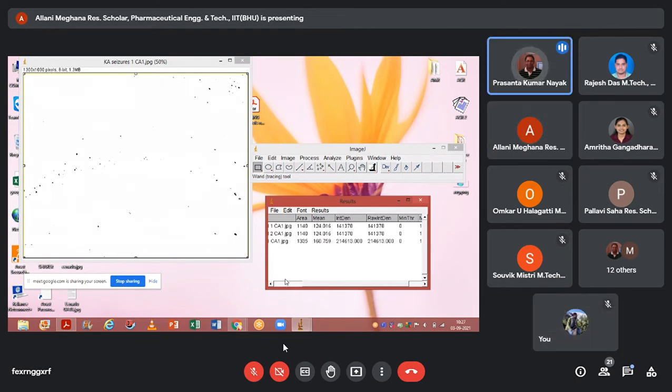So why, Sunil, are you asking why the threshold remains the same? Because the computer is subtracting the background, and it also needs to decide how much it can consider as c-Fos expression. We are saying that zero means nothing is there. When there are no dots, then it is zero. But it should not be too much. If you do not keep it constant, then it will count unwanted artifacts as well. For example, if you see this image, there were some artifacts.